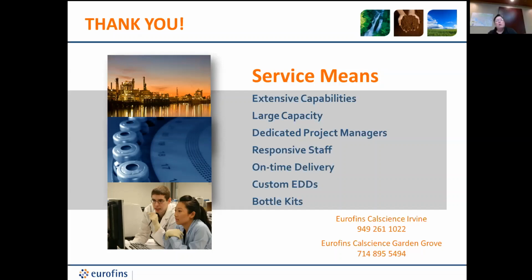Well, by the time your sample gets to us, quite honestly, for oil and grease, I don't know that the preservative is all that critical. We would probably go ahead and process your sample as is and just make a note if it didn't meet the pH, it wasn't less than 2. And at that point, then we'd have to determine how usable that data is.